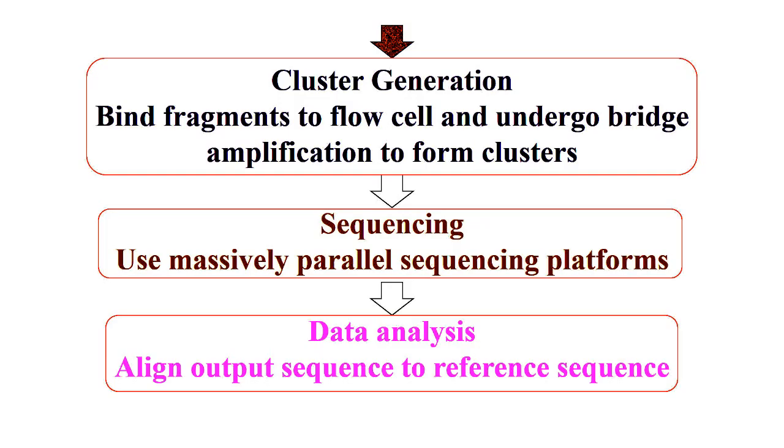And data analysis, by aligning the output sequences to a reference sequence, as mentioned in the next slides.